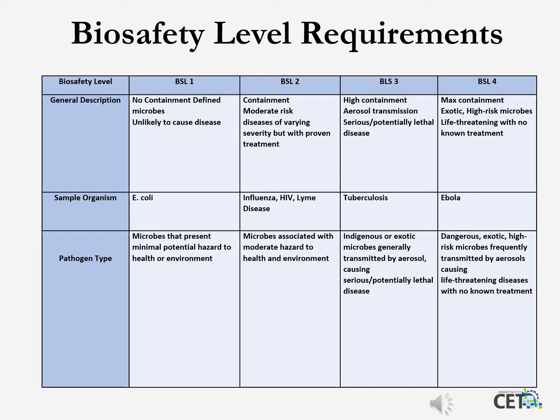This chart is a summary of the different biosafety level lab features that we've been discussing. You'll see a general description of those levels and a sample organism or disease, and then what effect those organisms or diseases have on us. If you're doing the skills training portion of this training, there will be much more discussion about all of this, including the mechanical features needed to meet those requirements.